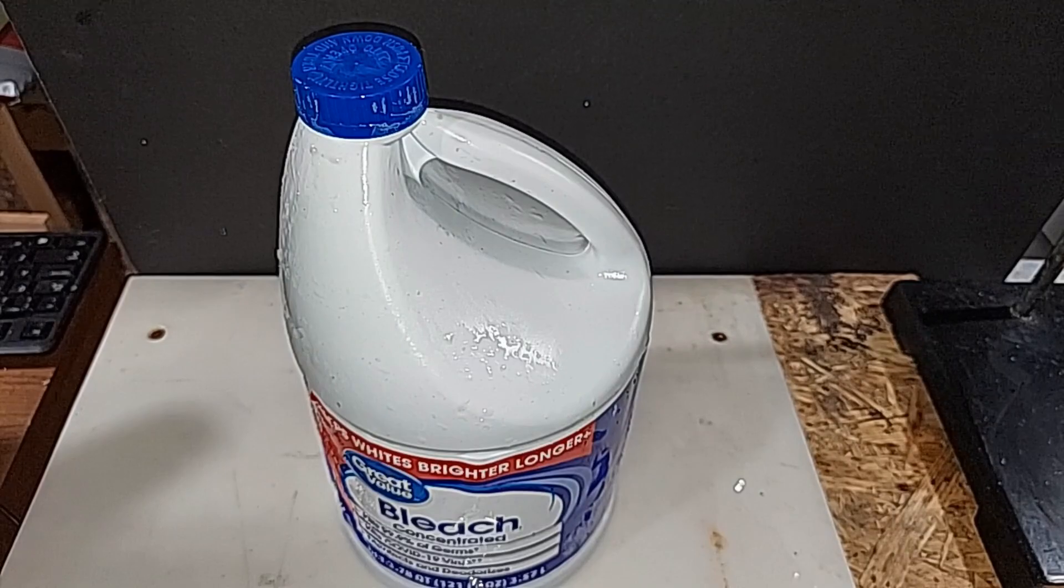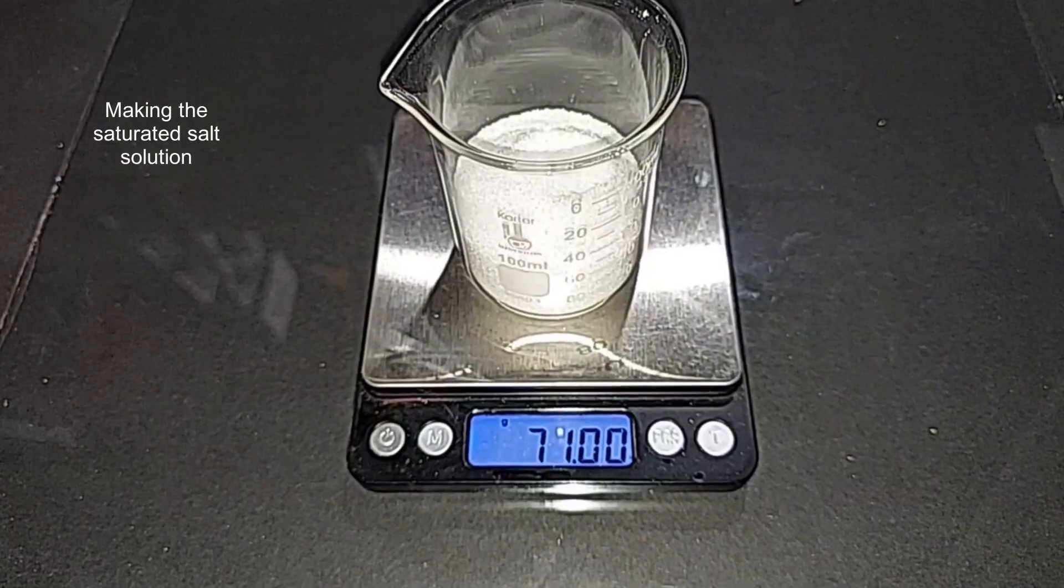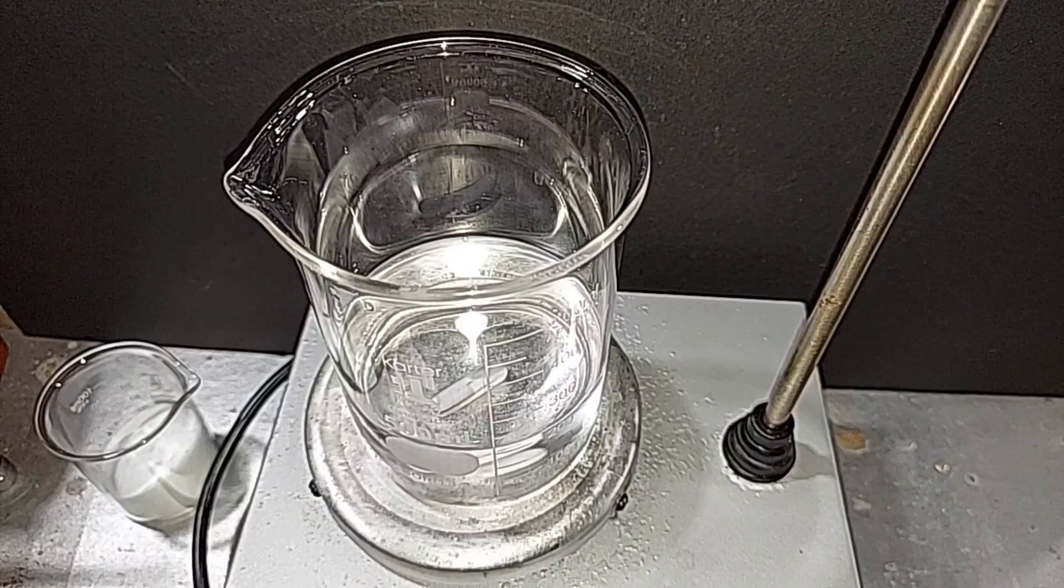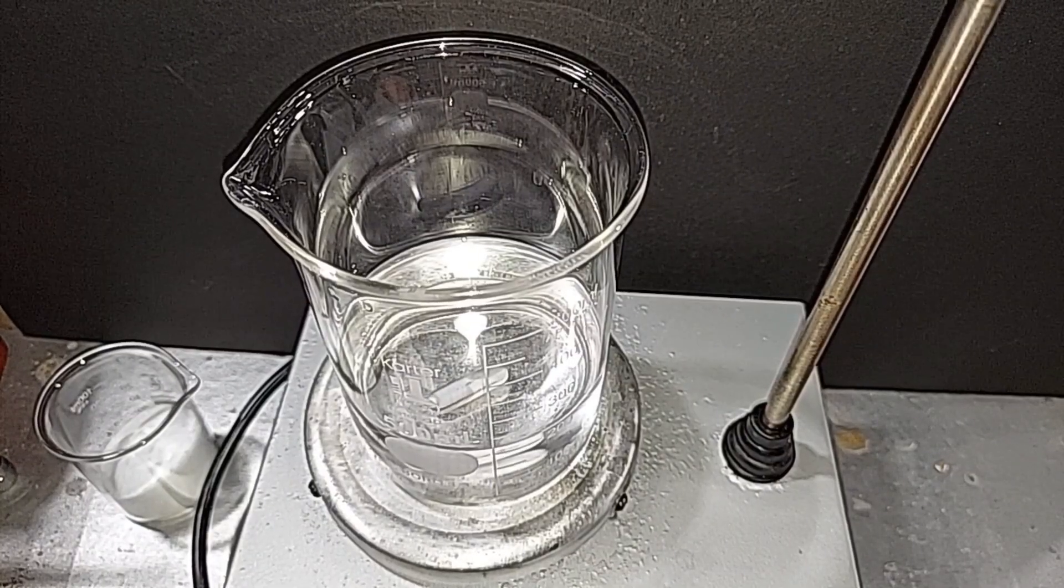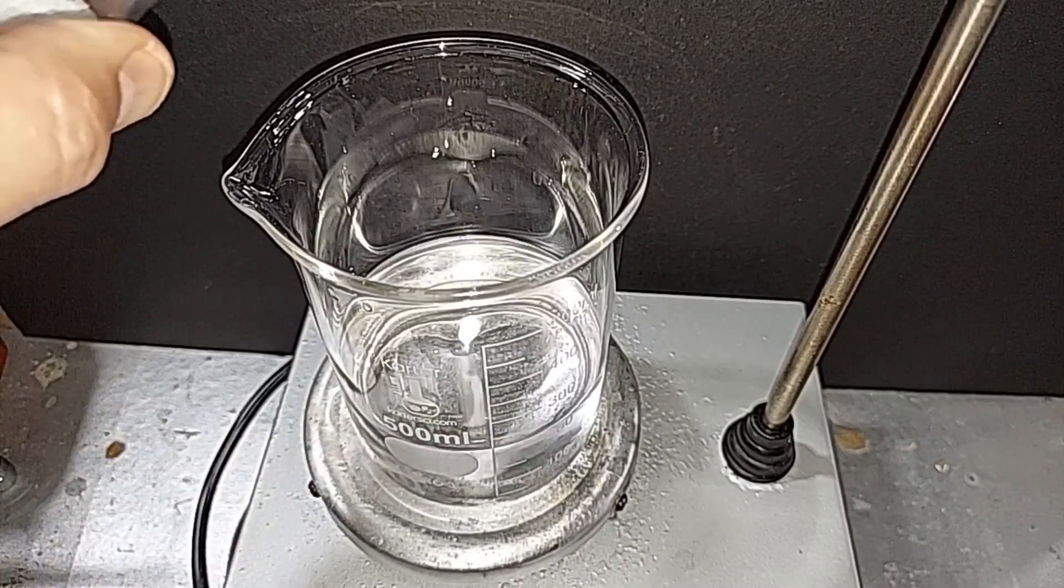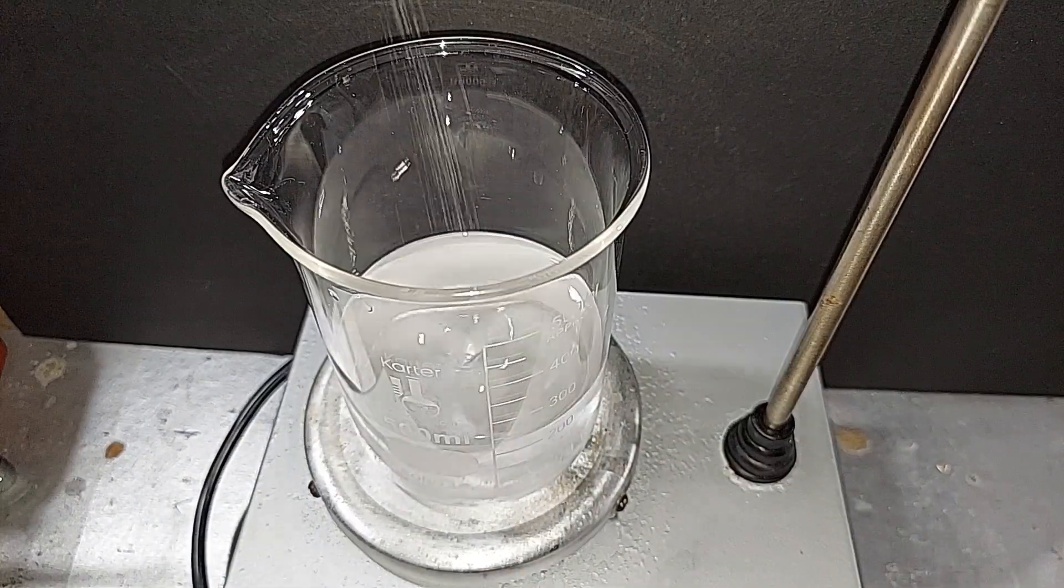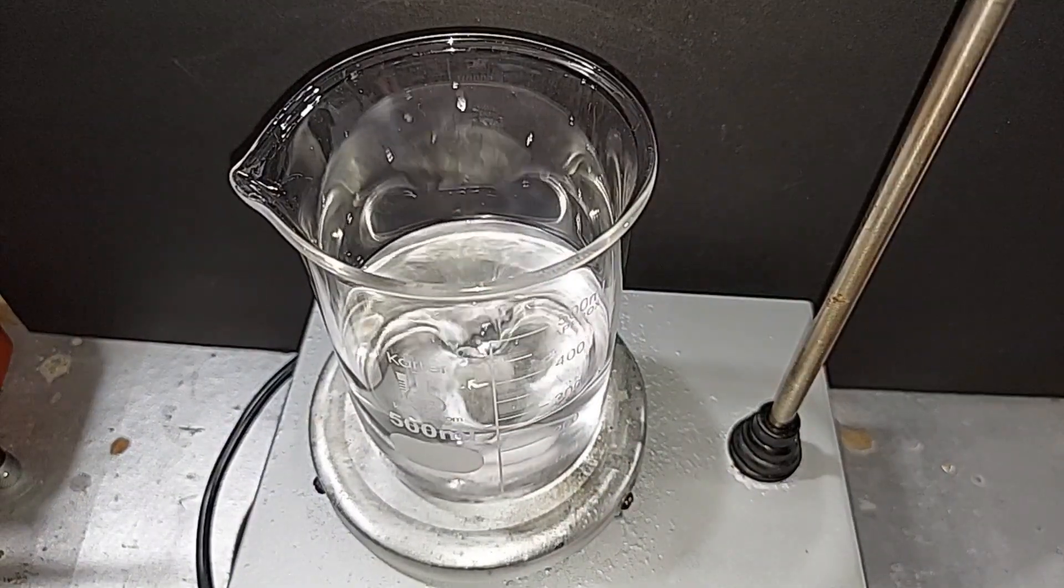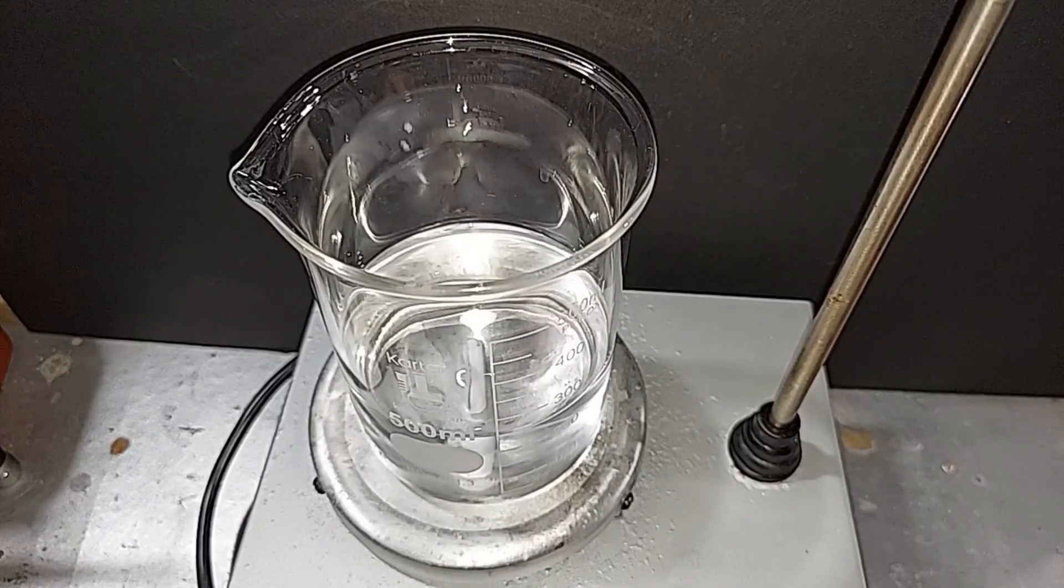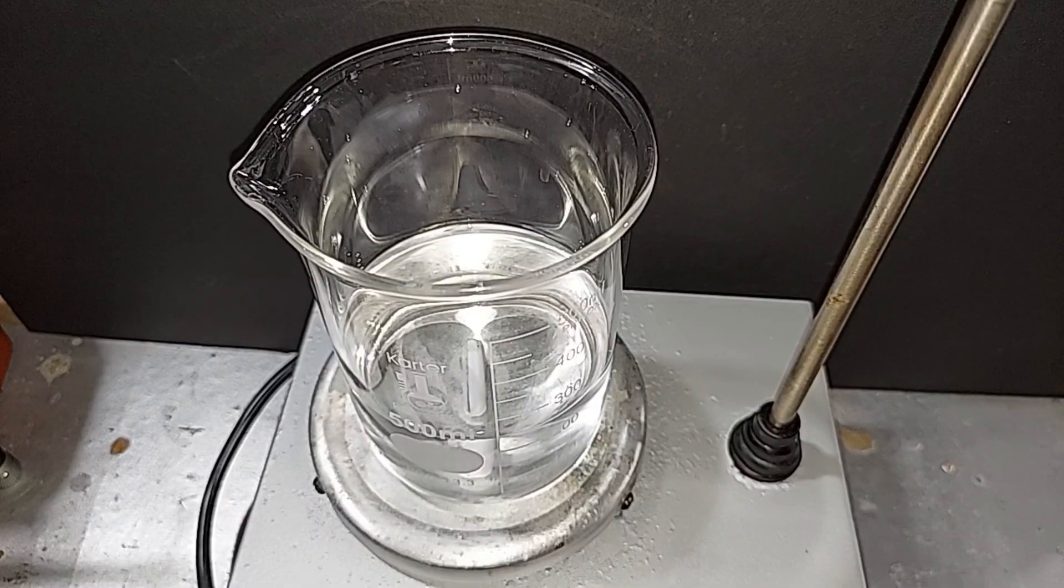200 milliliters of distilled water, pre-measured. 71 grams of iodine-free sodium chloride, pre-weighed. Here's our 200 milliliters of water. I'm going to turn on the stir bar, and we'll put in our 71 grams of salt slowly. All right, everything's dissolved. We still have to wait overnight for the reaction with the acetone and bleach to finish, but at least the salt solution is ready to go.